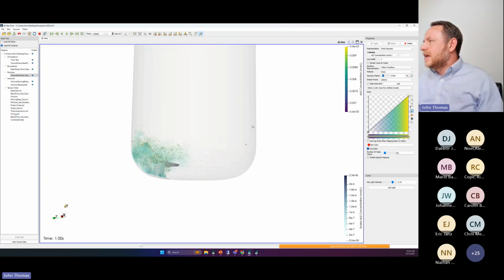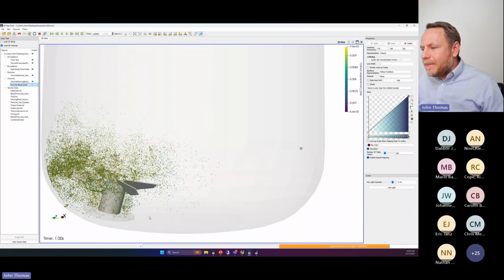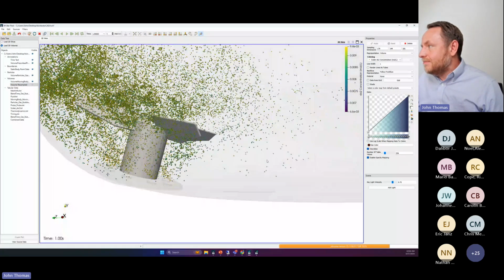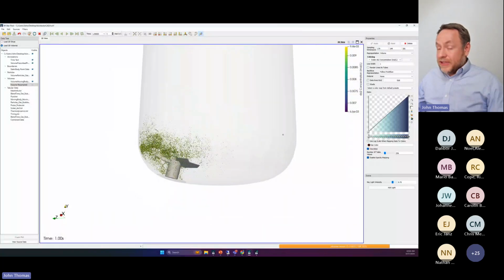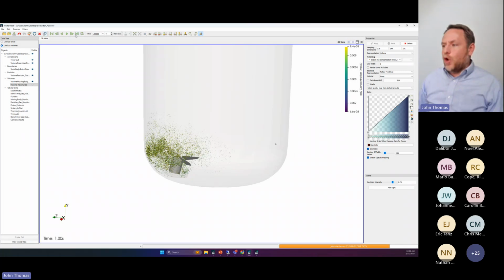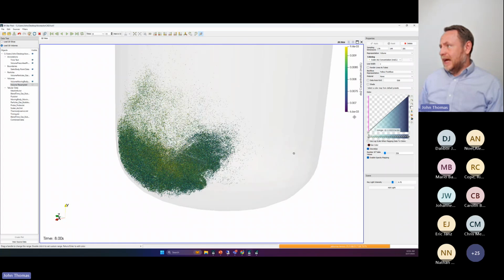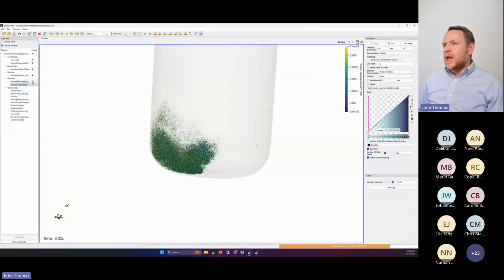I can see that they're actually losing a little bit of oxygen, which is not surprising. They're coming in very oxygen rich, but the longer they stay, they lose oxygen and they stop participating, as it were. This is real. This is what happens in a bioreactor. And it's physics that are very easy to capture and incorporate inside a model like this. I can see there's some bubbles here that have essentially lost almost a third of their oxygen, as it were. But here I see, for example, if I go ahead and jump over to this, let me see what time I'm at. I'm coming up on 3 seconds here.